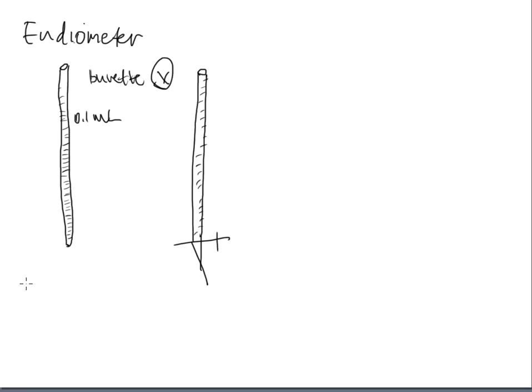All right, so for the eudiometer, you need to understand that there's not really a stopcock that we put onto this piece of glassware. It's not needed because we use this in a different way. And actually, the way that I've drawn it here, it's really upside down. The opening is actually going to go down, and the closed end is going to be up toward the top. So overall, a eudiometer's purpose is to trap and measure something, okay?